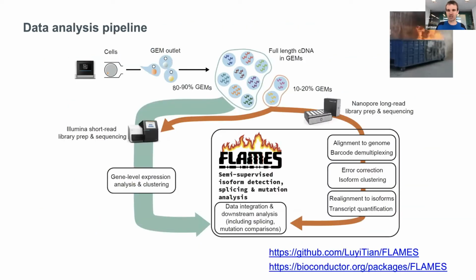So this brings us to the interesting part for us as bioinformaticians, which is, well, what do you do with the data? So Jafar's done the wet lab side of things and prepared libraries, and they've been sequenced, and then we have the raw data. So what are we going to do with that? And unfortunately, there were no tools available at the time we started this study. So it was a bit of a dumpster fire in terms of being able to very easily analyze these data, but we were motivated, obviously, because we thought the data would be quite interesting to explore, to develop our own.